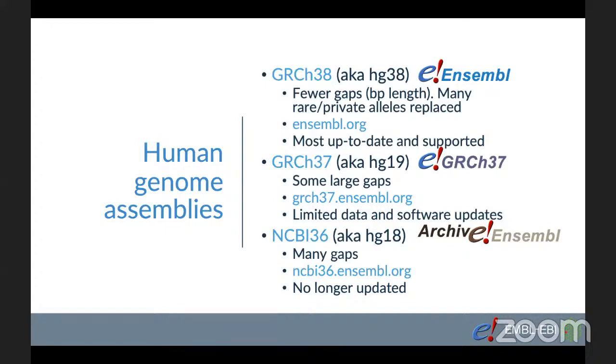And finally, we also host an even older human genome assembly, NCBI 36, frozen in time in our archives, so it's no longer updated and it's a bit rubbish. There are so many gaps and errors.